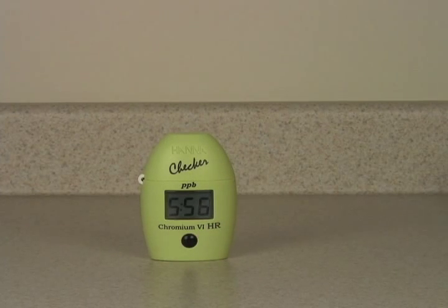The meter will now count down a six minute reaction time. The six minute countdown has elapsed and the meter has now taken a measurement. We have 11 parts per billion of Chromium-6 in our local drinking water.